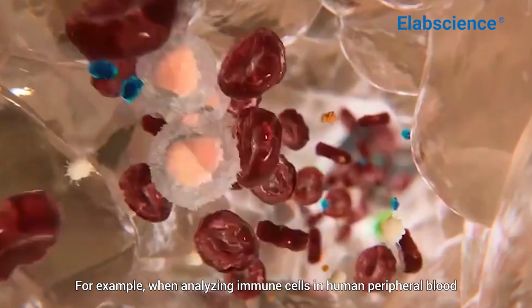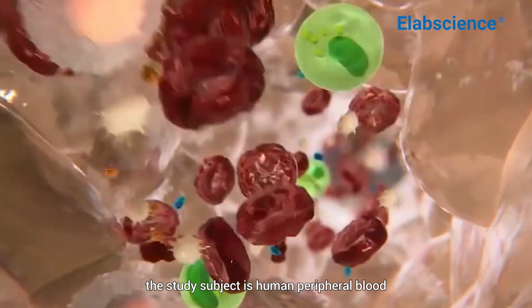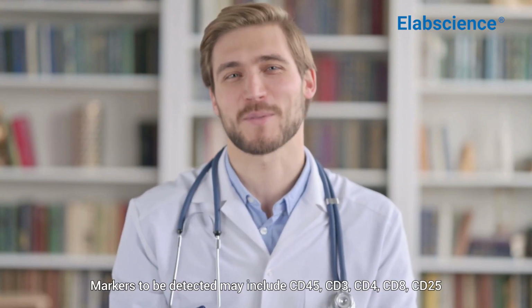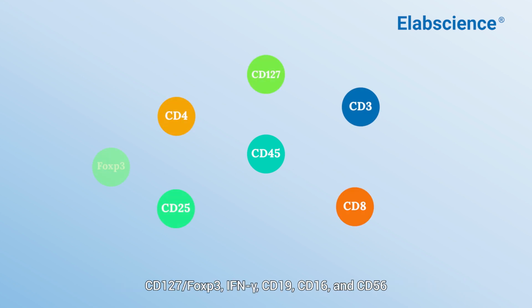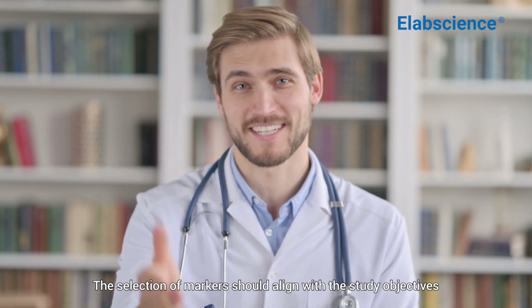For example, when analyzing immune cells in human peripheral blood, the study subject is human peripheral blood, so antibodies need to choose anti-human. Markers to be detected may include CD45, CD3, CD4, CD8, CD25, CD127, FOXP3, IFN gamma, CD19, CD16, and CD56. The selection of markers should align with the study objectives.